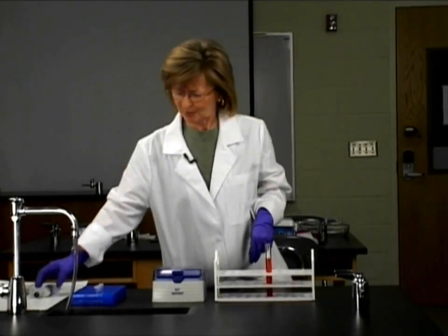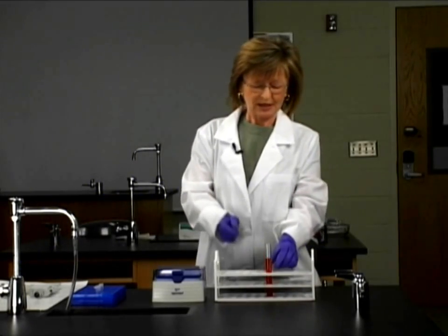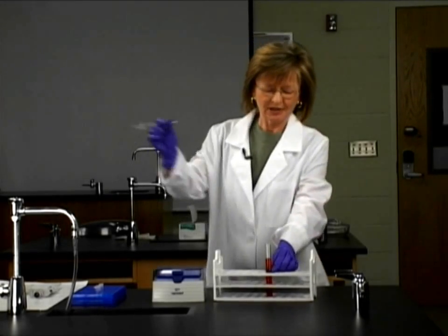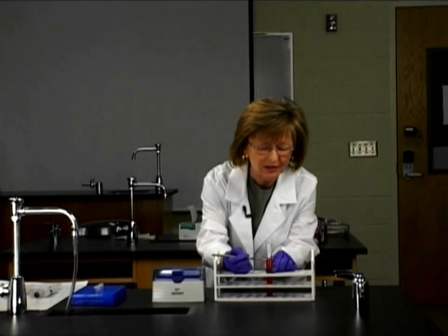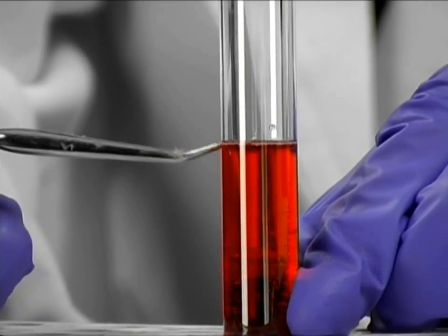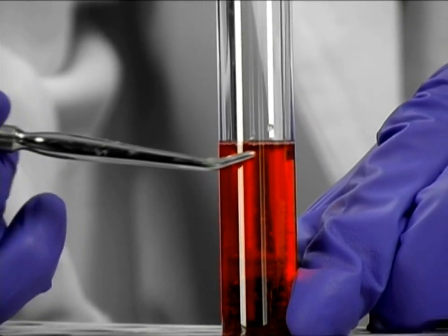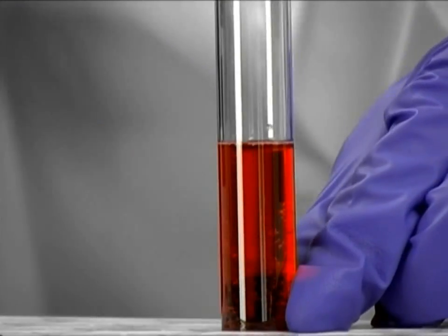We're all set to go in a couple of minutes, because first you can see here on the bench that I have a test tube filled with a red liquid. It's an aqueous solution — water and some red pigments. And you can see along the very front of this tube that the water makes a crescent shape. This is called the meniscus.